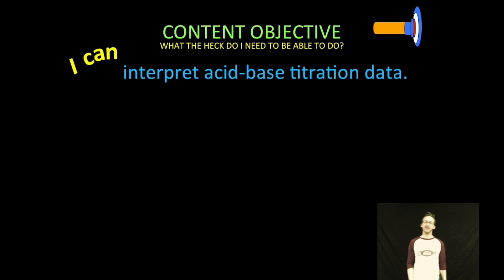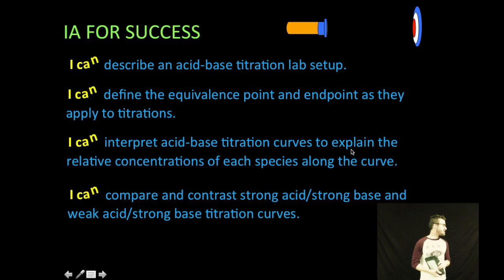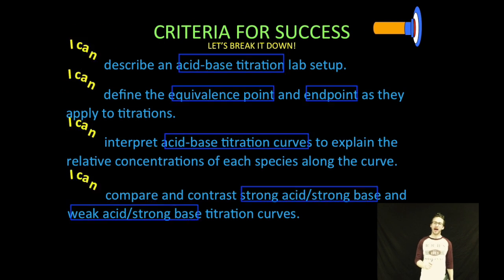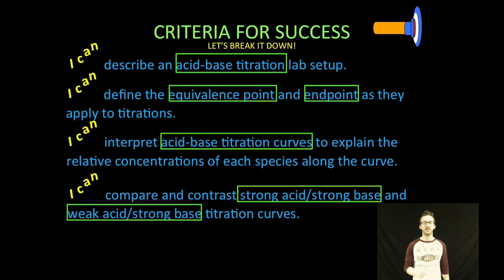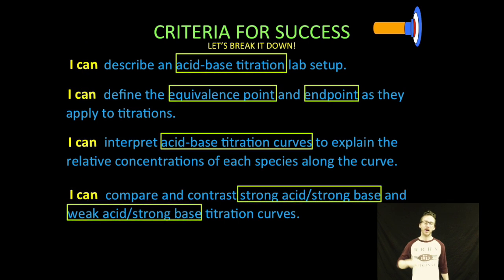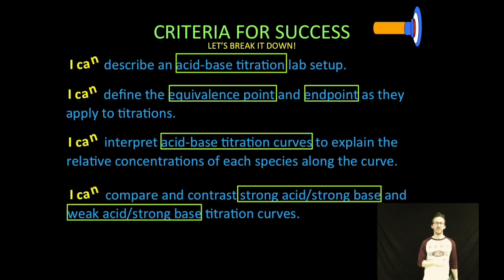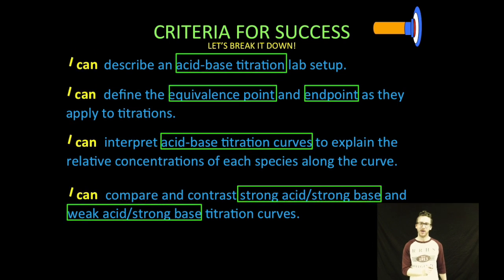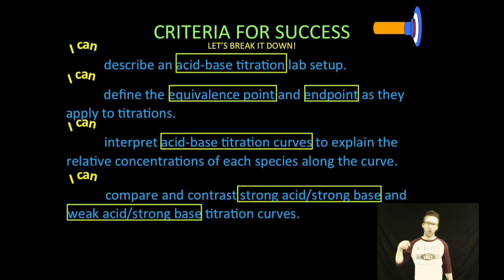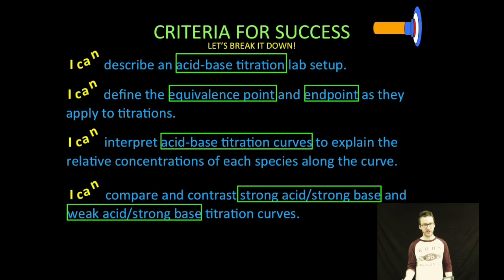Boylan, and today in this video, we are going to interpret acid-base titration data. As always, taking a couple minutes to break it down, first we're going to describe an acid-base titration lab setup. What the heck is an acid-base titration going to look like in the lab? Number 2, we are going to define the equivalence point and endpoint as they apply to titrations. What are those things? What do they mean when we're talking about titrations?